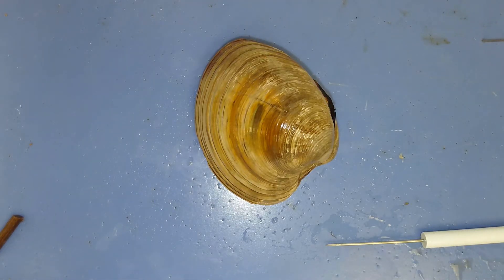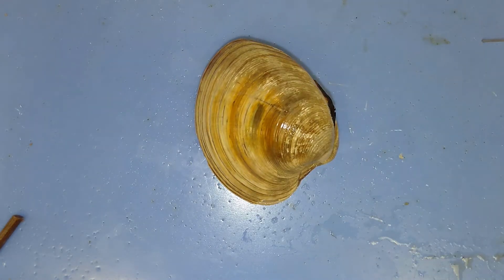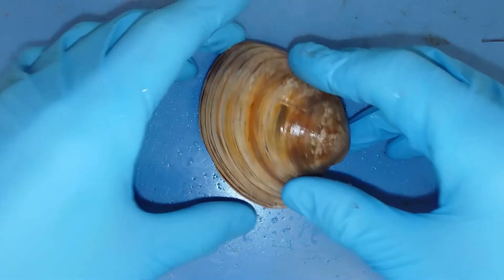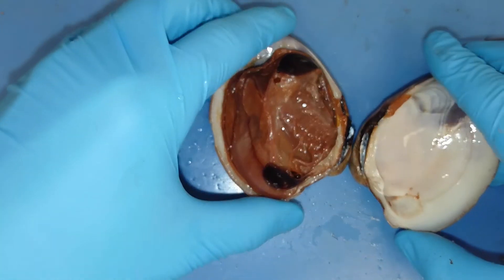Here we have a mollusk, specifically in the class Bivalva. In the class Bivalva, these individuals will have two outer shells that they can close like this using a single hinge.